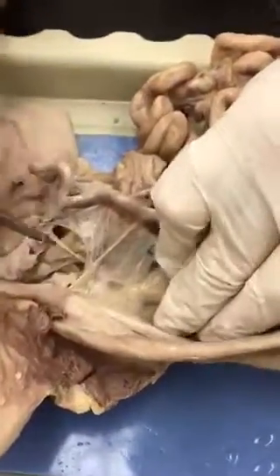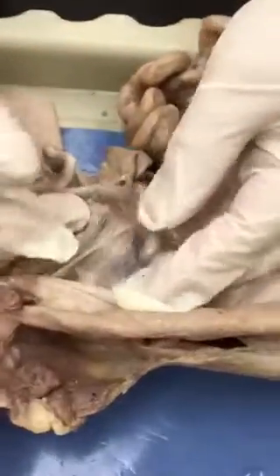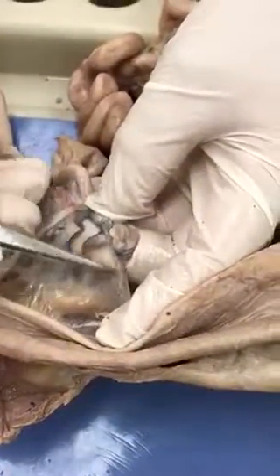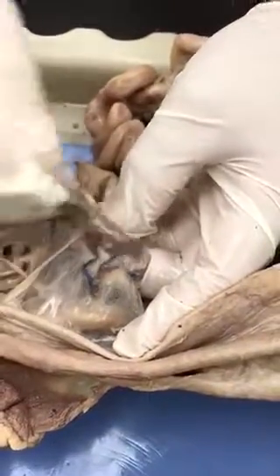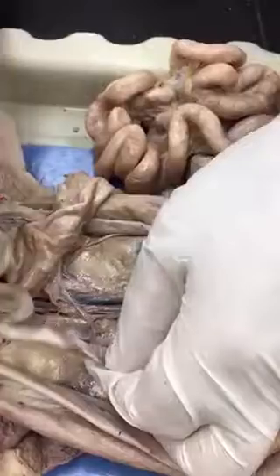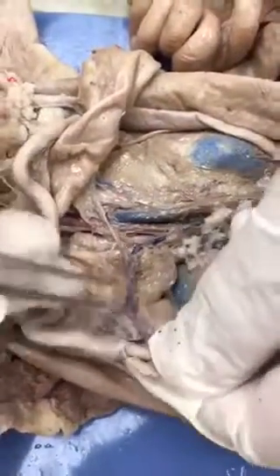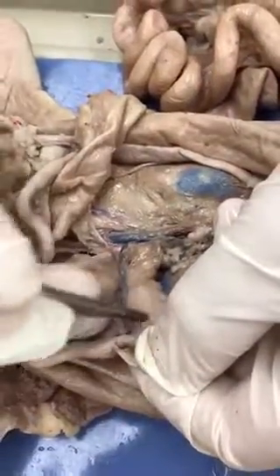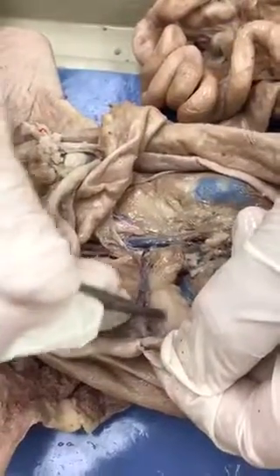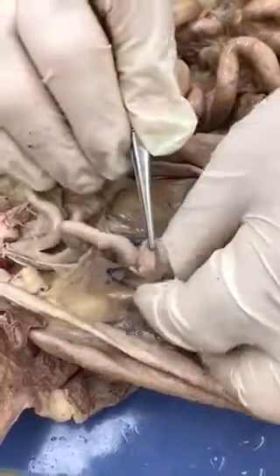Then the other two parts of this broad ligament, this part here that's attached to the uterus is the largest part, but then some of it here goes up to the ovary. This part is the mesovarium, ovarium for ovary. Mesentery that goes to the ovary. Let's flip it over where we can actually see the ovary. Here's the ovary on this side right there. So you can see this tissue here, this mesentery, right in here connects and holds on to the ovary. That's mesovarium.